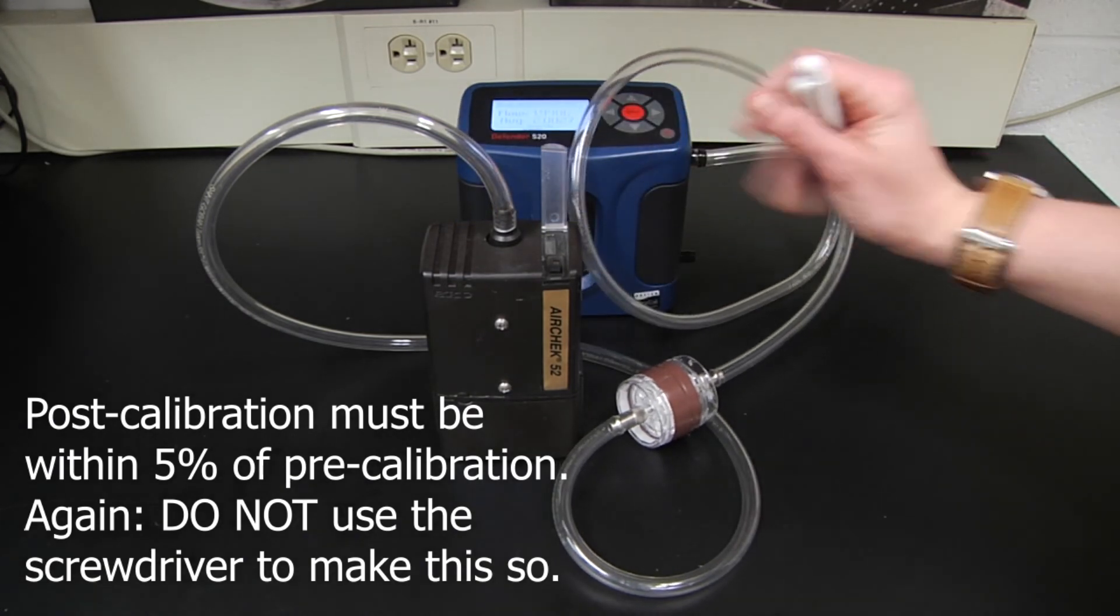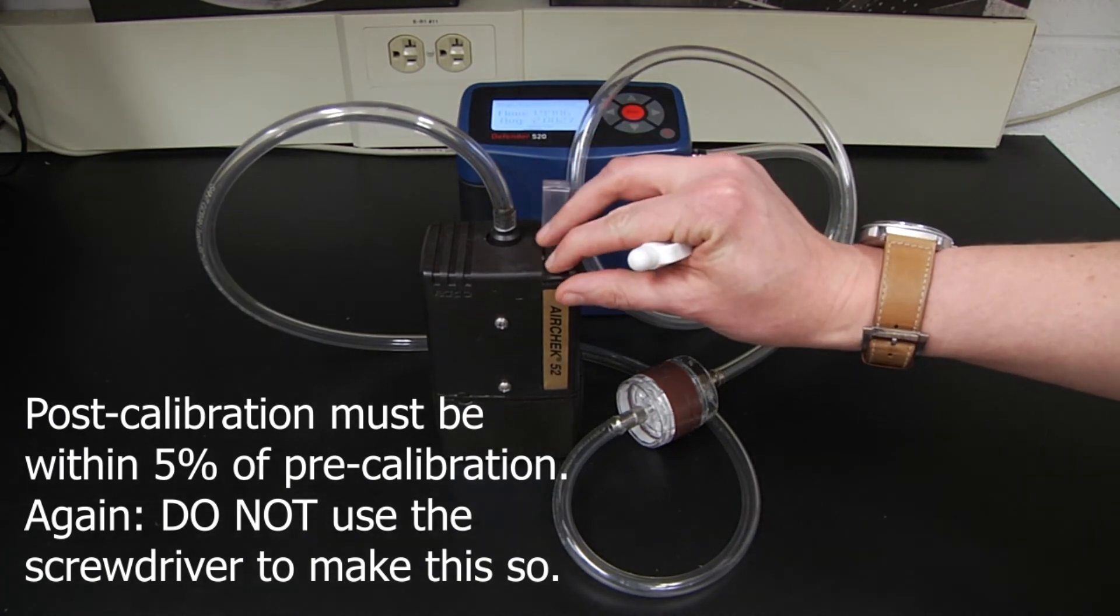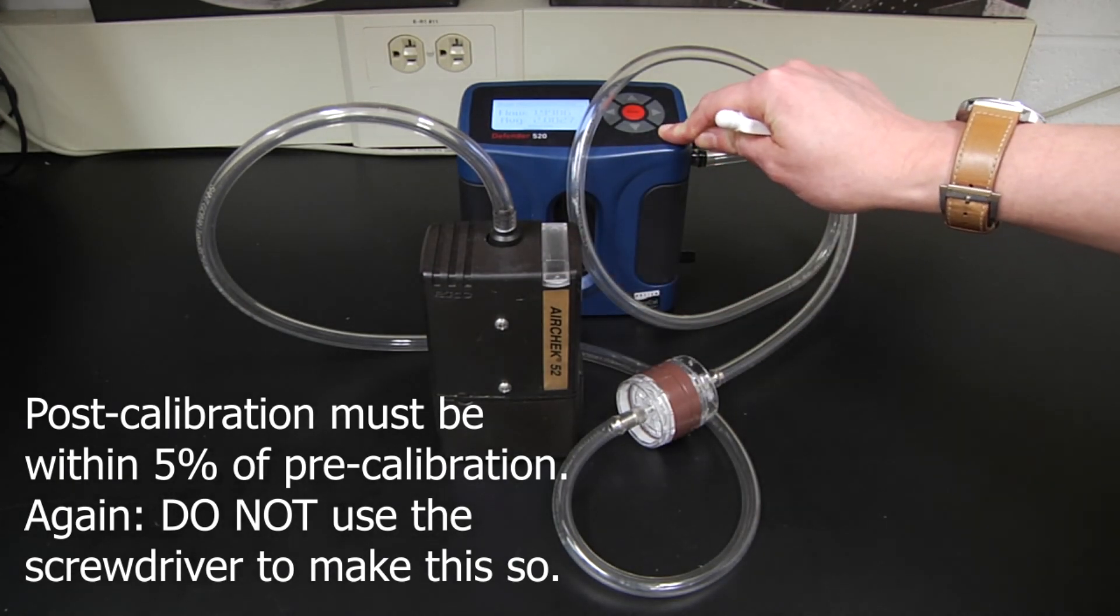If your flow rate is not within plus or minus 5% of your pre-sampling calibration value, then you must discard your sample.